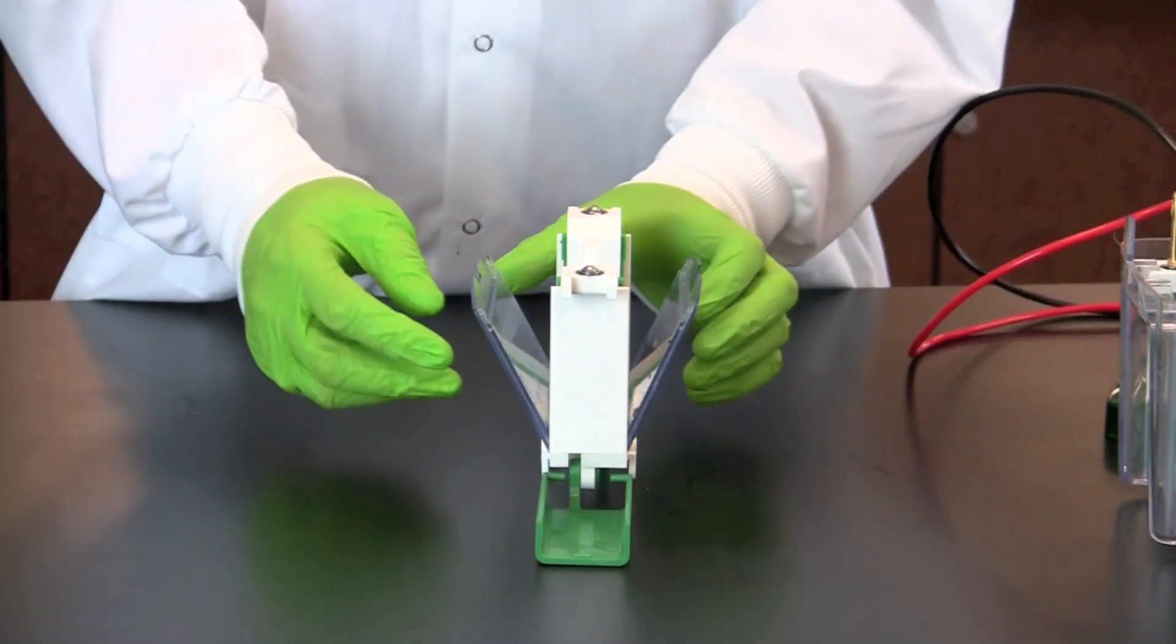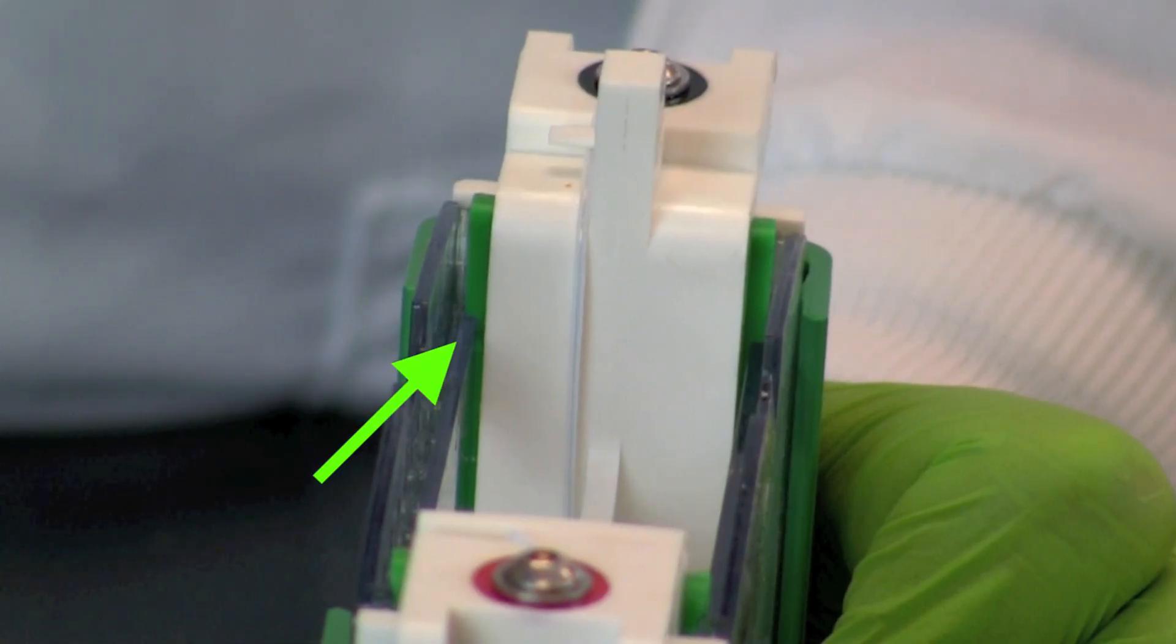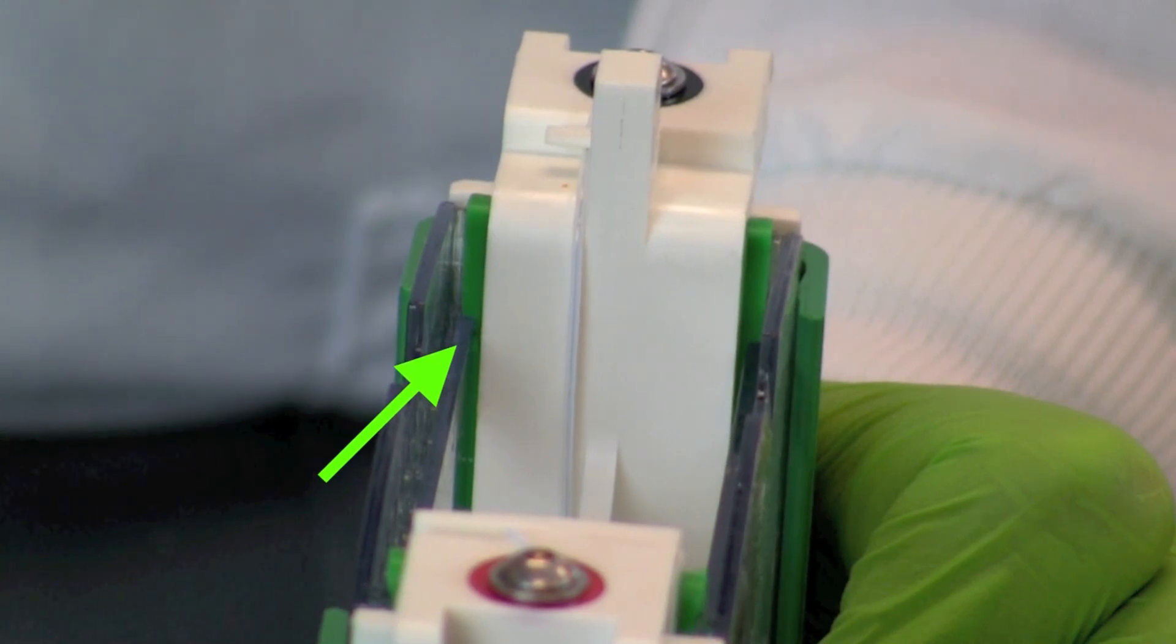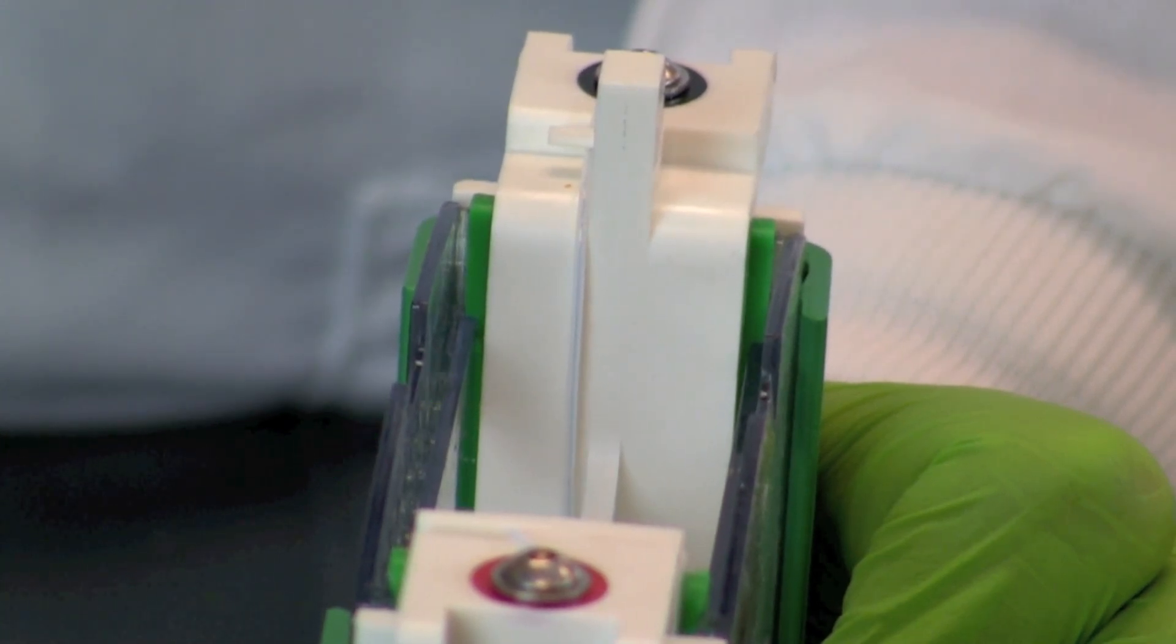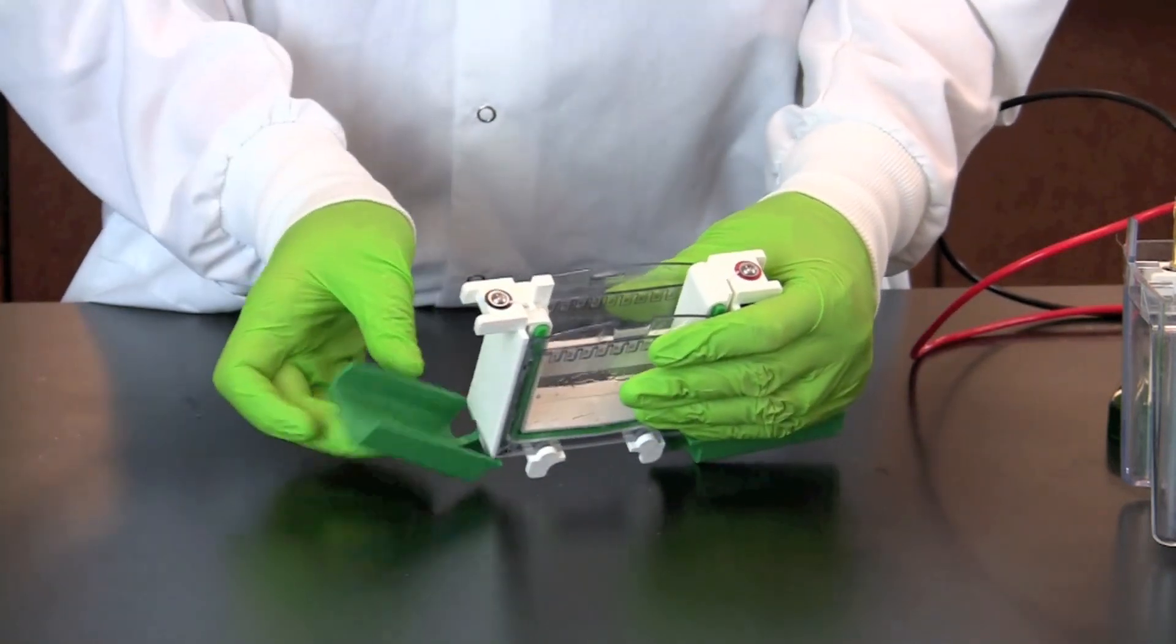Push the gels toward each other, making sure they are flush against the notched green gaskets, and that the short plates sit just below the notches of the gasket. Lock the green clamps over the gels.